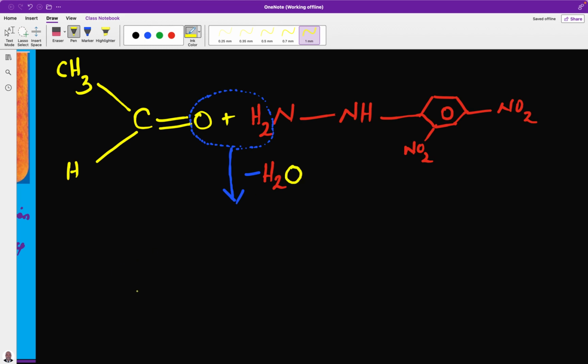And what will be the product? This will be our product here.